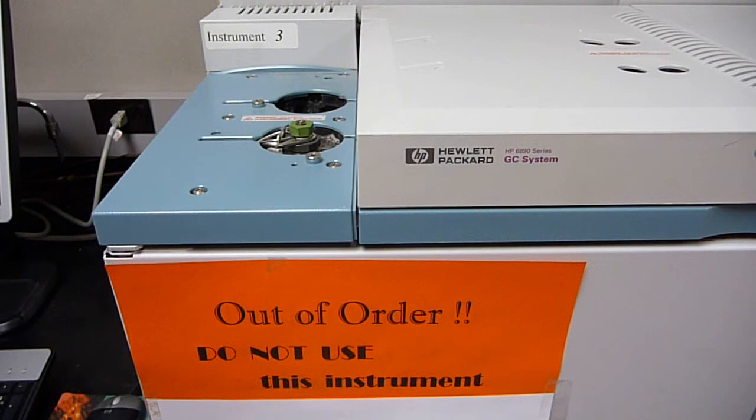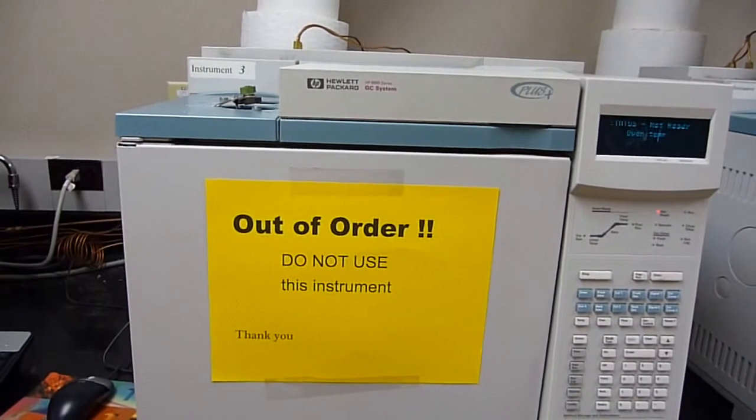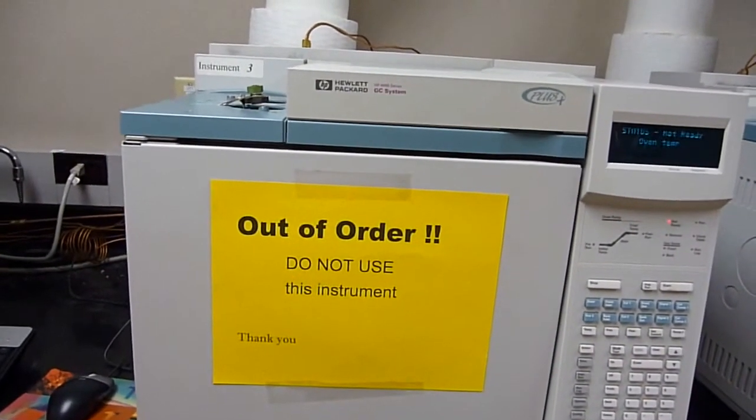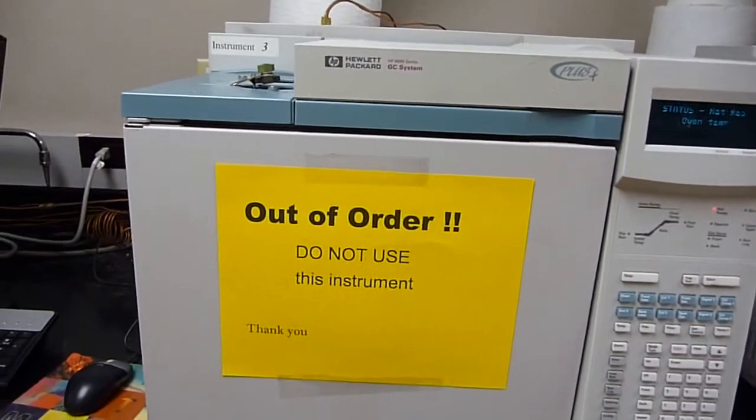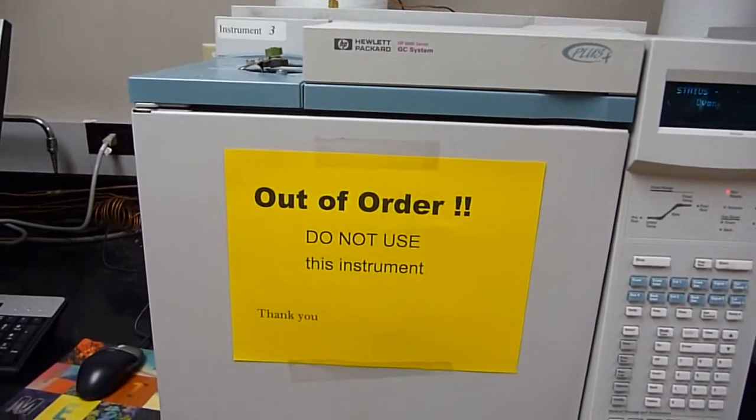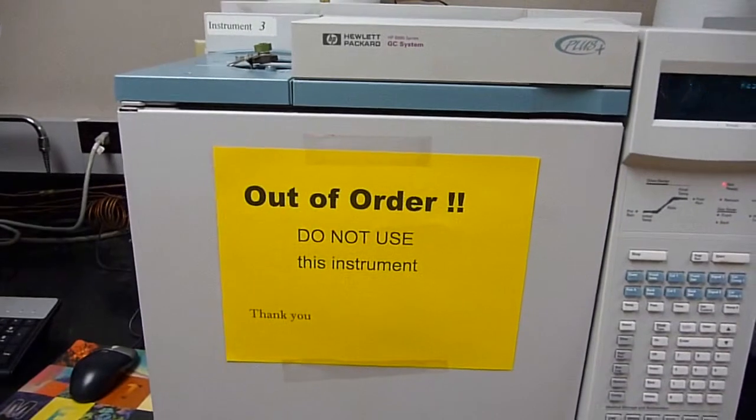Times and descriptions for the various segments of this video are in the YouTube Show More box. This is a repair on a Hewlett Packard, now Agilent, 6890 GC. And the symptom is the oven temperature doesn't heat. So, let's start fixing the problem.